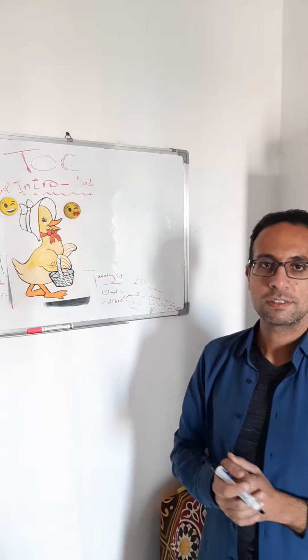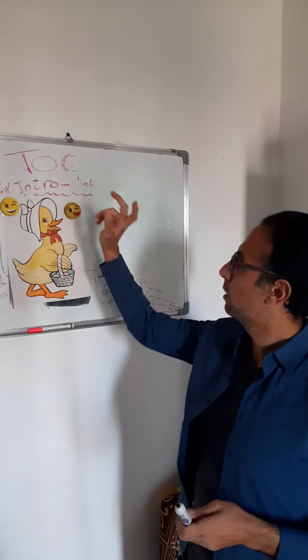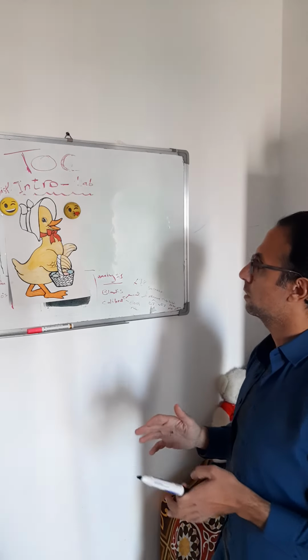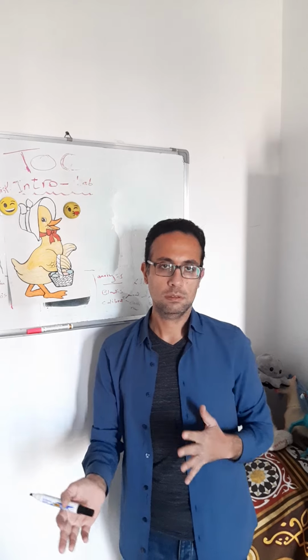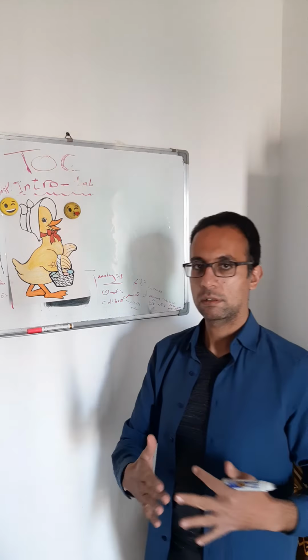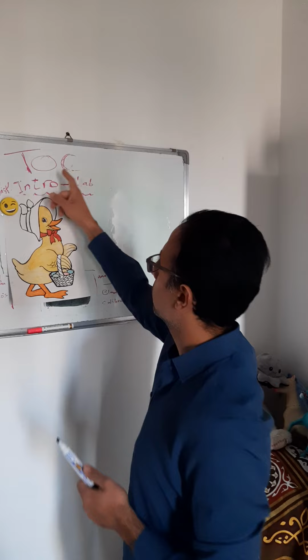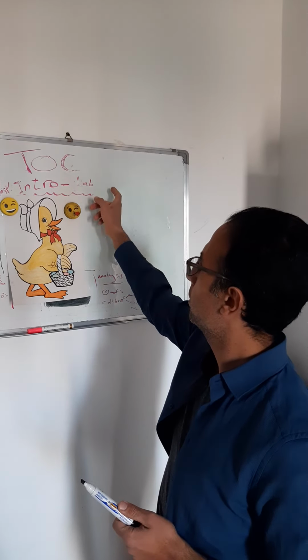Today we'll talk about TOC also. We started about it in the previous video. Today we'll take an actual introduction to TOC, total organic carbon analysis, but as a practical introduction more than theoretical. We will do a quick skimming, hopefully to be useful. So today we'll talk about a TOC quick introduction for the lab.